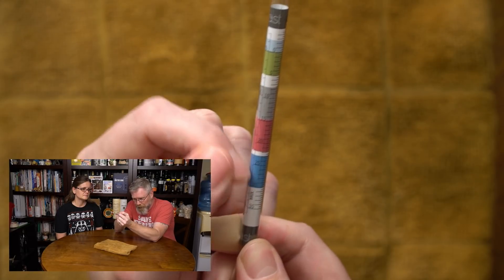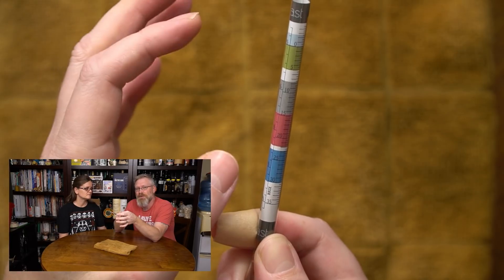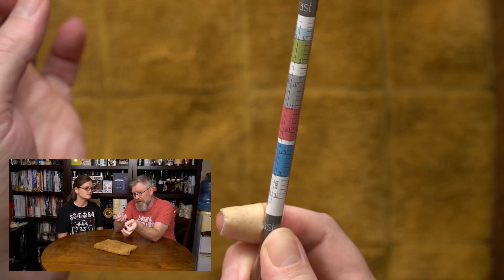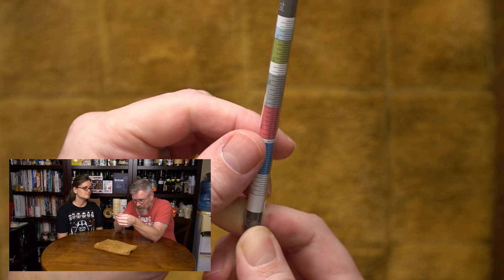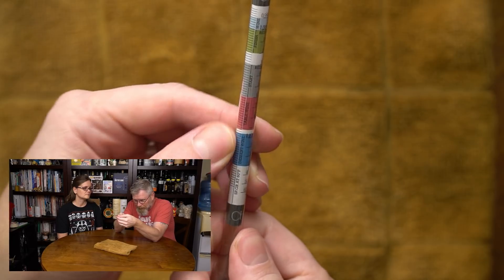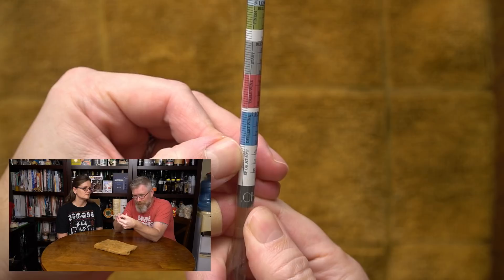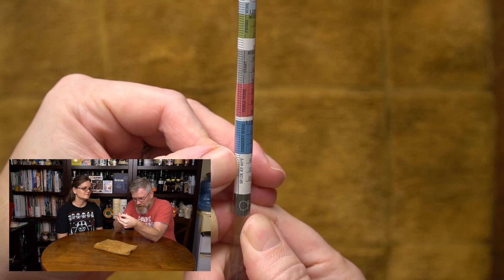Then over here we have the Brix scale. This is a completely different unit of measurement than specific gravity. It's similar, but it's a whole different way of doing it. I'm not going to get into it because quite honestly I don't understand it and I don't use it — I use specific gravity. And see that right there? Spagr at 60°F. That's specific gravity at 60 degrees Fahrenheit.